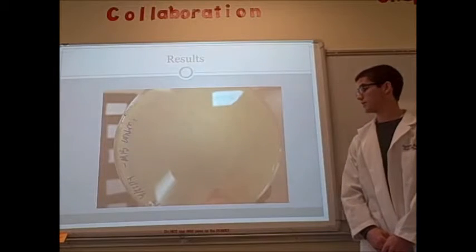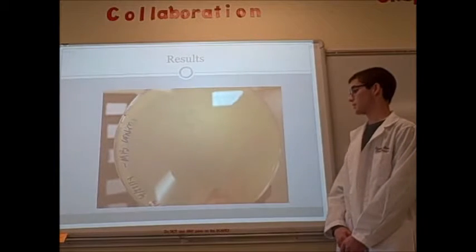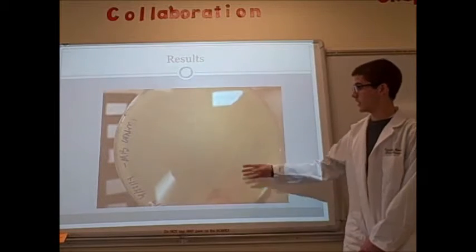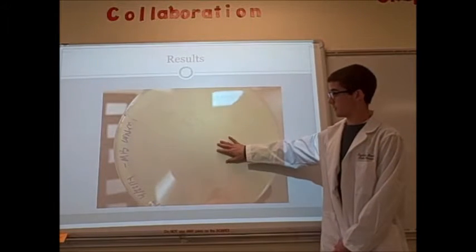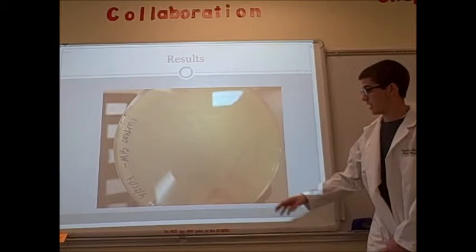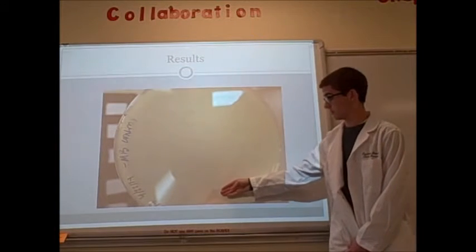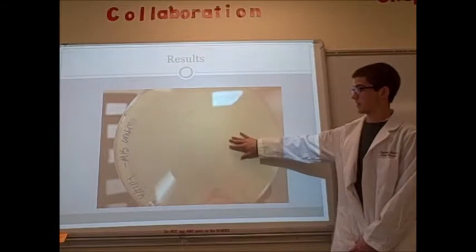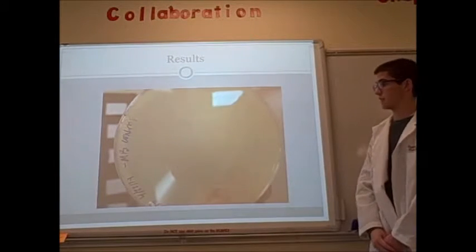This plate indicates the negative M13 control, which was not transformed with M13 DNA. However, there appear to be some plaques and plaque growth on the plate. As you can see, there is definite bacterial growth by these lines here. This is odd, considering that this plate was not transformed and therefore should not be producing phages.